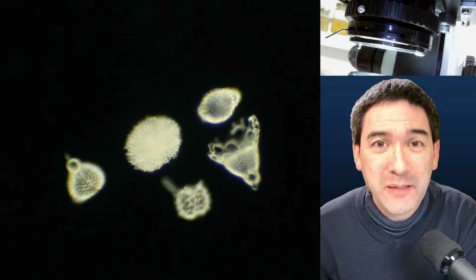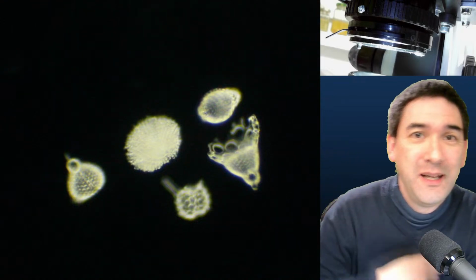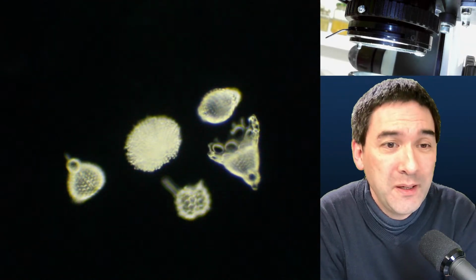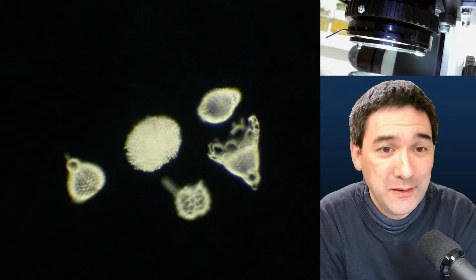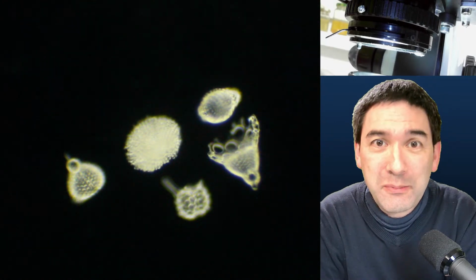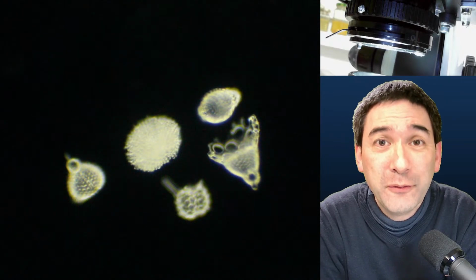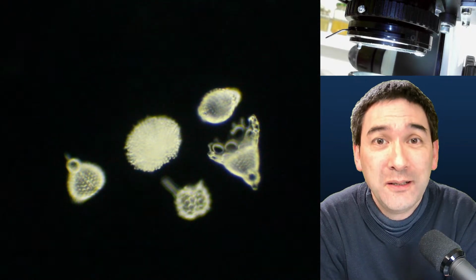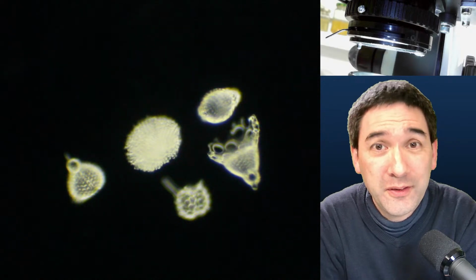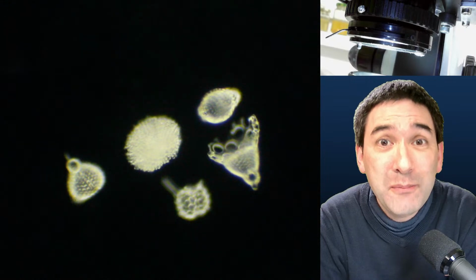Yes, what you're able to see over here on the side, these are forams, foraminifera in darkfield. What I would like to do today is a little bit difficult to explain. I would like to explore the effect of different mounting media on the image quality, and whether the specimens are then also suitable for the different imaging techniques.